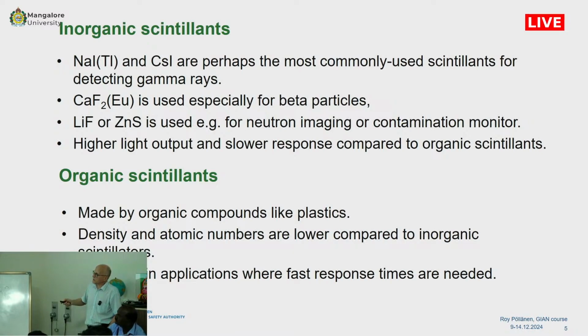Organic scintillants, it's a difficult thing. They are made of compounds like plastics. The point is that the density and atomic numbers are lower compared to these, which means that they are not necessarily as efficient as inorganic scintillants.